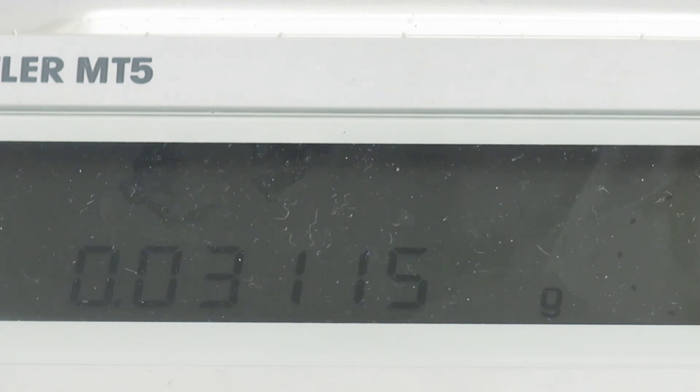So this is a Mettler MT5 microbalance. Nick Edmond, Richmond Scientific. I hope that you found that useful.